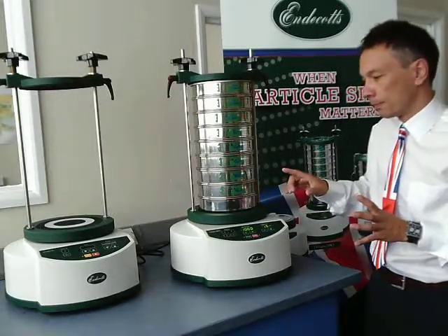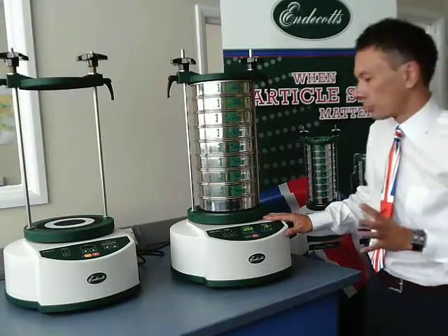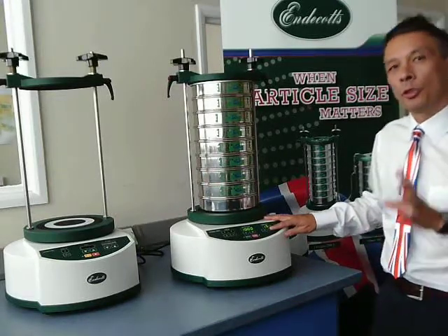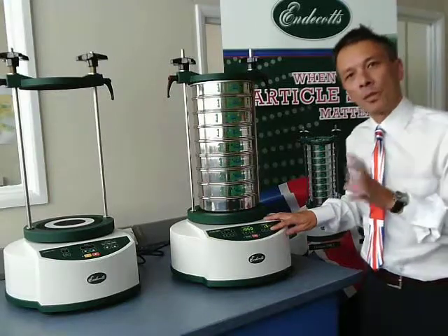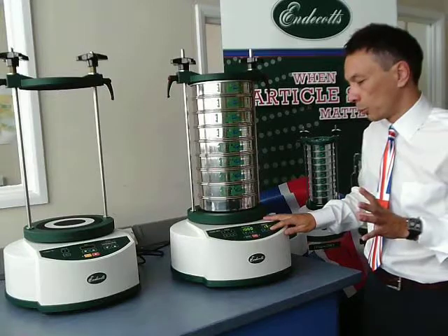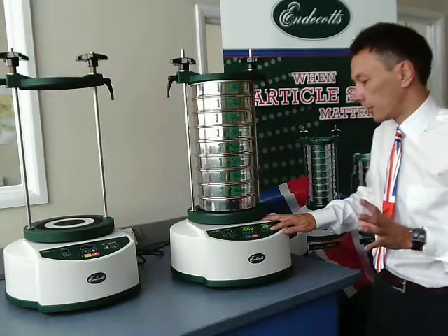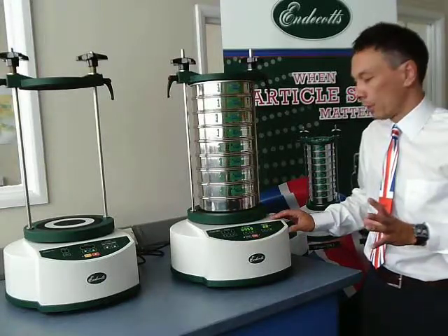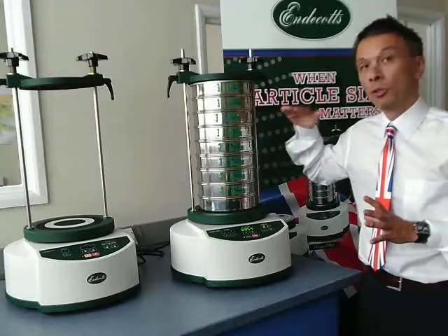There are some unique features to this that you will not find in most shakers on the market. For instance, we have an amplitude control. Not only can you alter the amplitude, but it also measures the physical measurement of the amplitude. So if I want to shake the machine at 2mm, it will shake at 2mm. I've just adjusted it, switched it on, and within a few seconds it reaches the amplitude required.